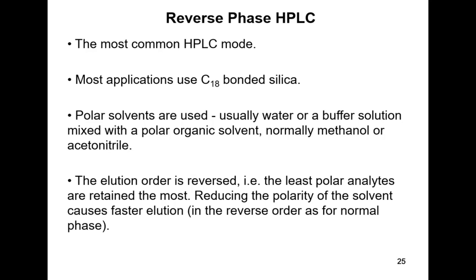So we're using water as one of the solvents, but it's usually mixed with a polar organic solvent, which will mix with the water. Most commonly it's methanol or acetonitrile, both reasonably unpleasant compounds, but they're not that volatile, so you can get away with using them in the lab as long as you've got good ventilation.